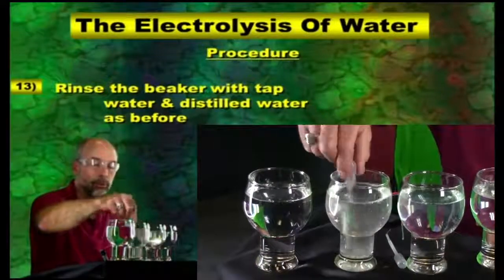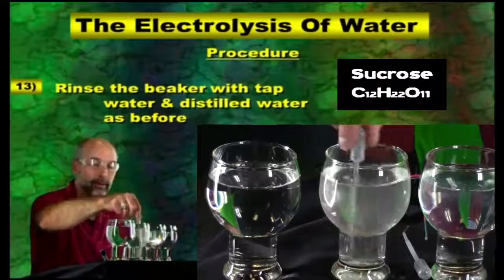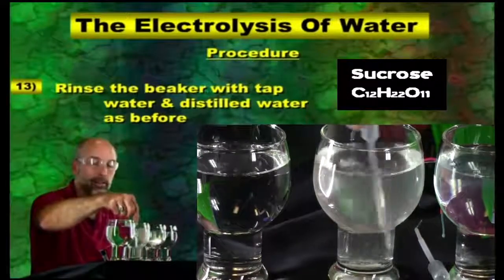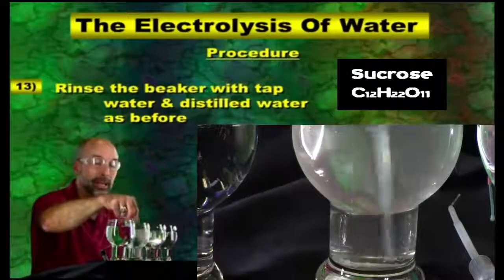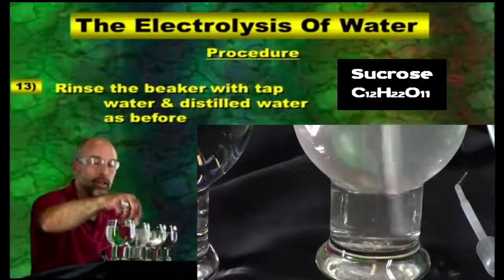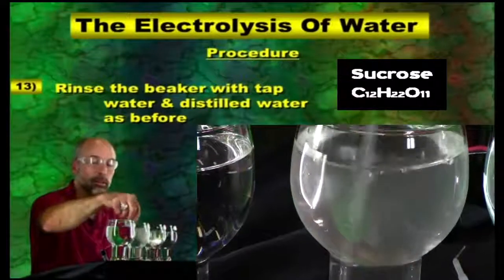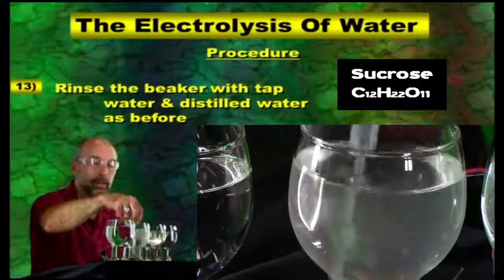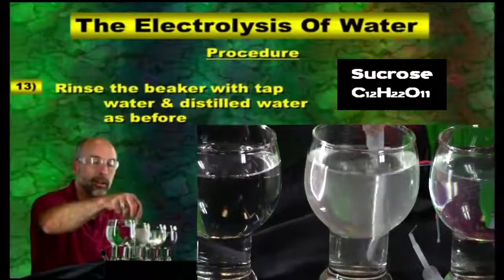And we look at the chemical formula associated with this. All right, what do we expect to see happen here? Is this covalent? Is it ionic? If it's ionic, it should conduct electricity. If it's not ionic, it's covalent, it should not. So what do you think based on the chemical formula? If you want to, pause, think about it. Take a look at the various atoms on the periodic table. See if you can figure it out.